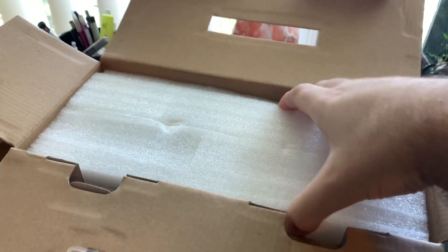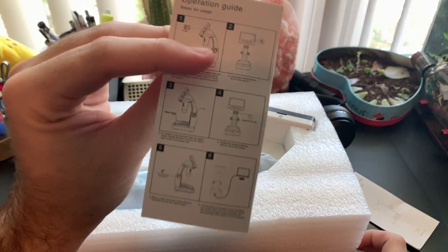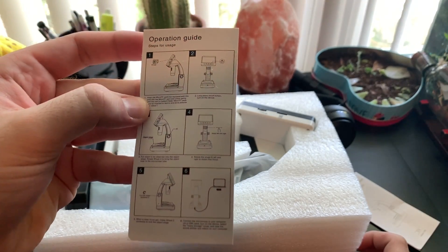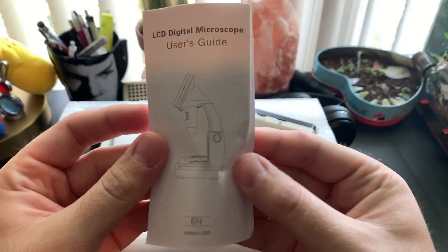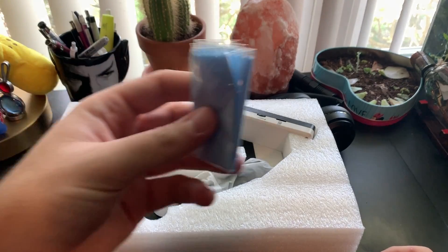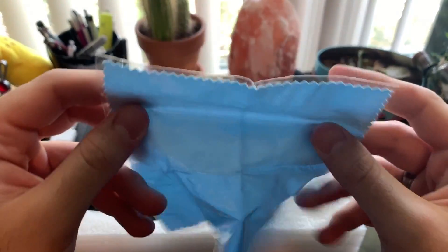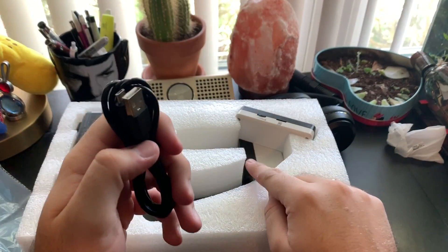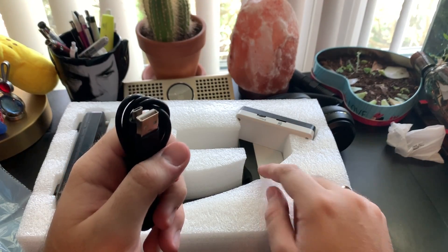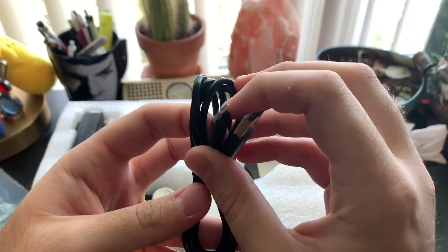Let's go ahead and open this up. First things first is a quick operating guide — just very basic, everything you need right there. There's also a bigger user manual. You get a microfiber cleaning cloth and a micro USB charging cable. This has a built-in 1500 milliamp hour battery so it doesn't need to be plugged in to work — you can bring this with you anywhere. That's probably the coolest feature: it's battery operated.